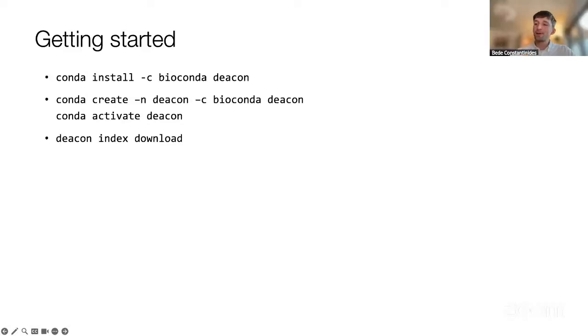Yeah, so someone reached out to me a few months back and asked if they could use it for mice. And there's a good collection of mouse genomes available, sort of mouse pangenomes. So I constructed an index for pan mouse, which is called pan mouse one, which you can download in the same way, I believe, using the command line. But I would say, and this is maybe an advantage over some other methods, that it's really not too difficult to build these indexes yourself.